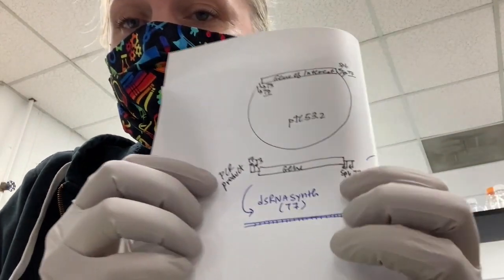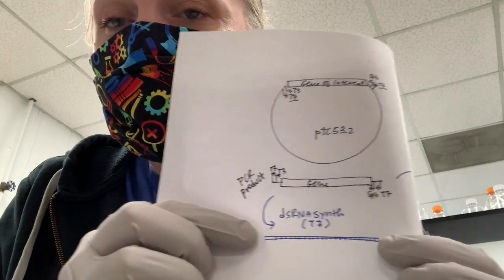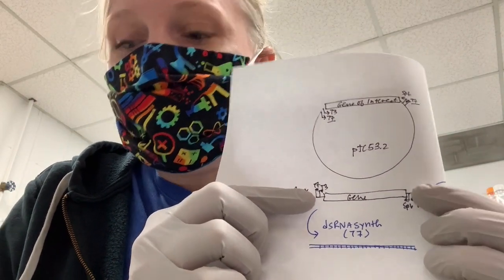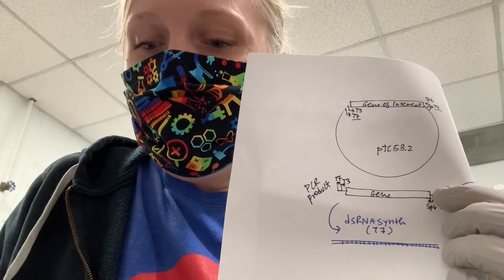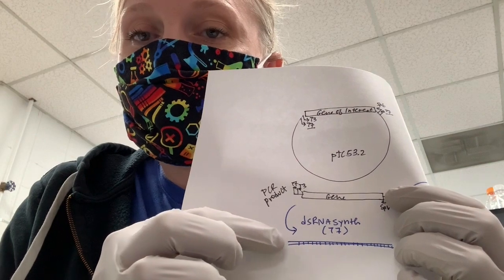And so if you imagine what's in this tube, we had our PCR product, and then we added the reagents to make this double-stranded RNA, so synthesizing the RNA from the DNA. In our tubes then we have the template PCR product, we have our double-stranded RNA, and then we have all of these enzymes and buffer reagents that we used to make the double-stranded RNA.